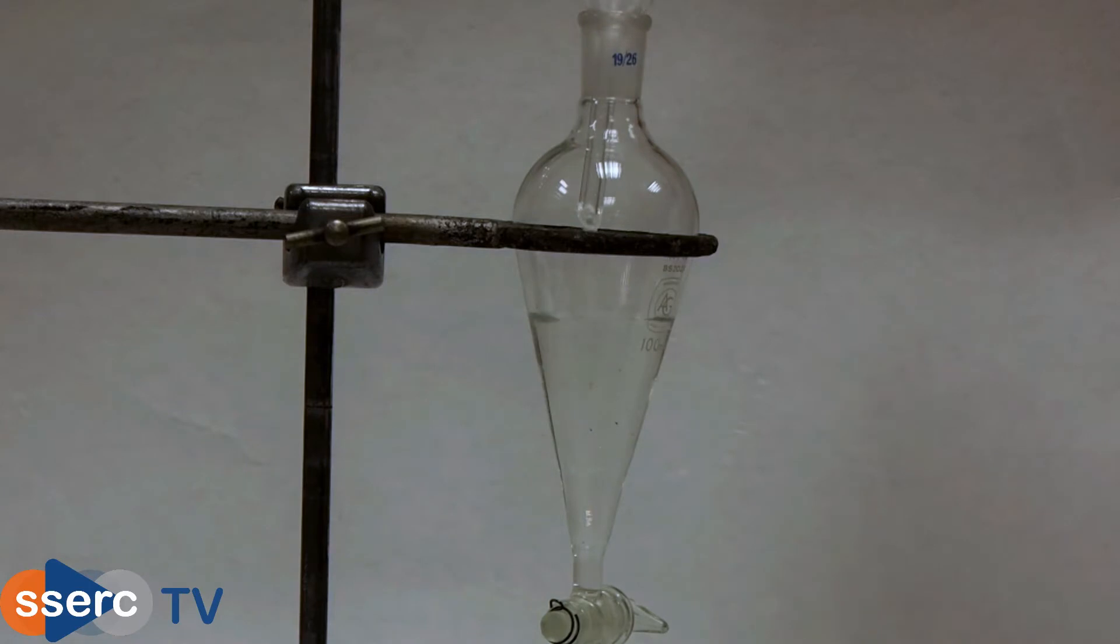Now add 20 cubic centimeters of ethyl ethanoate, ethyl acetate. You can see that this forms a separate layer on top of the water.